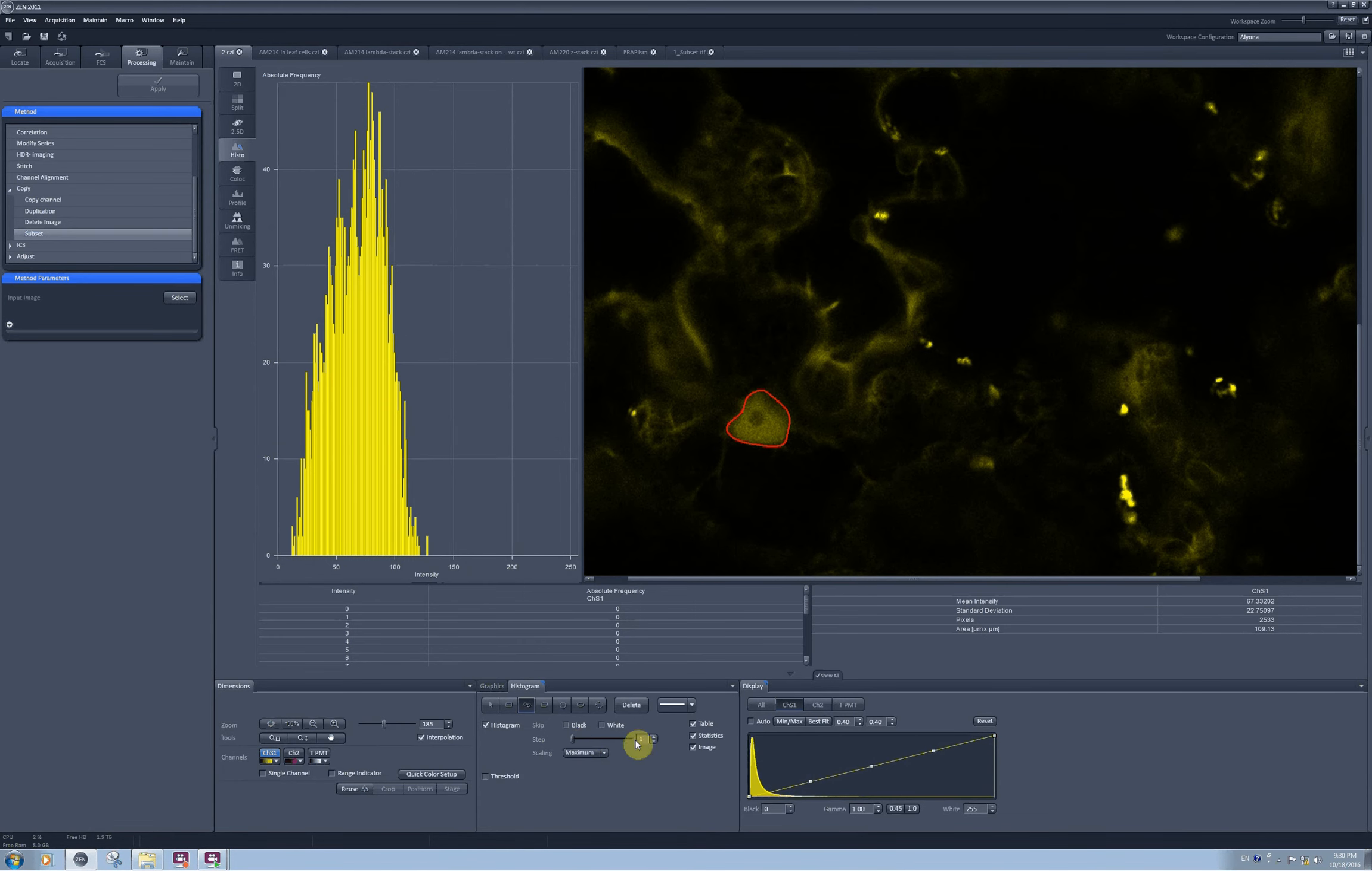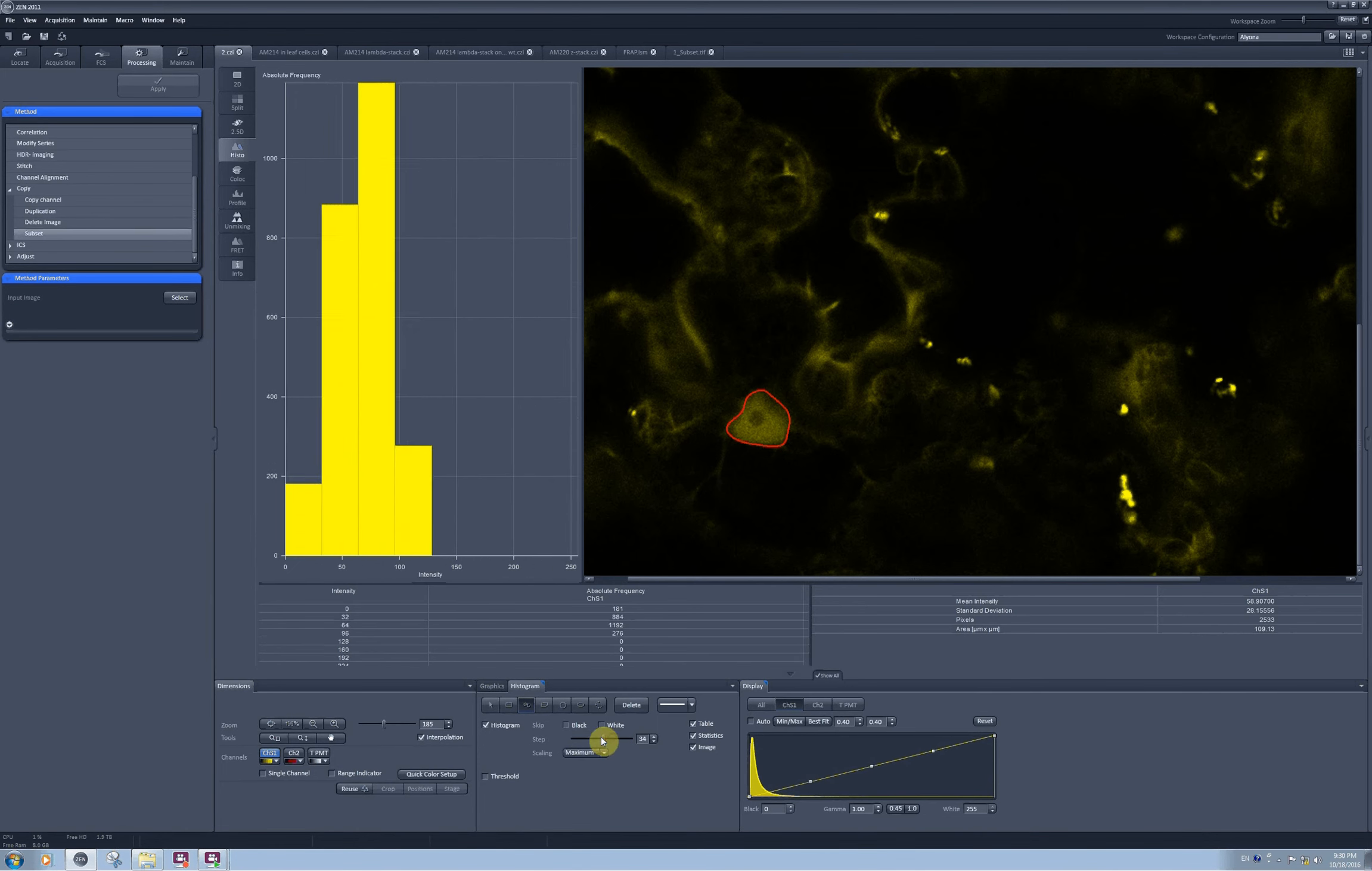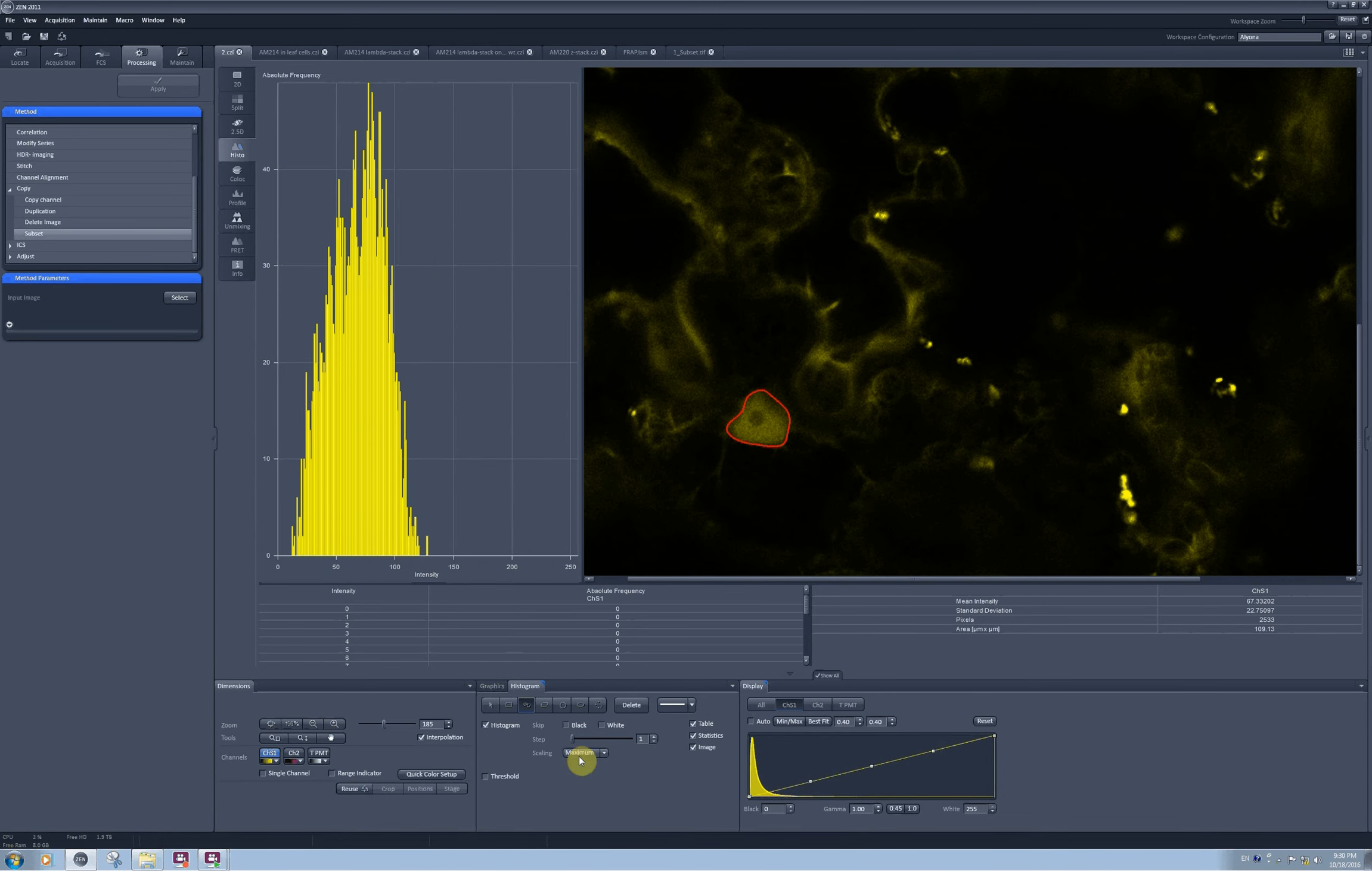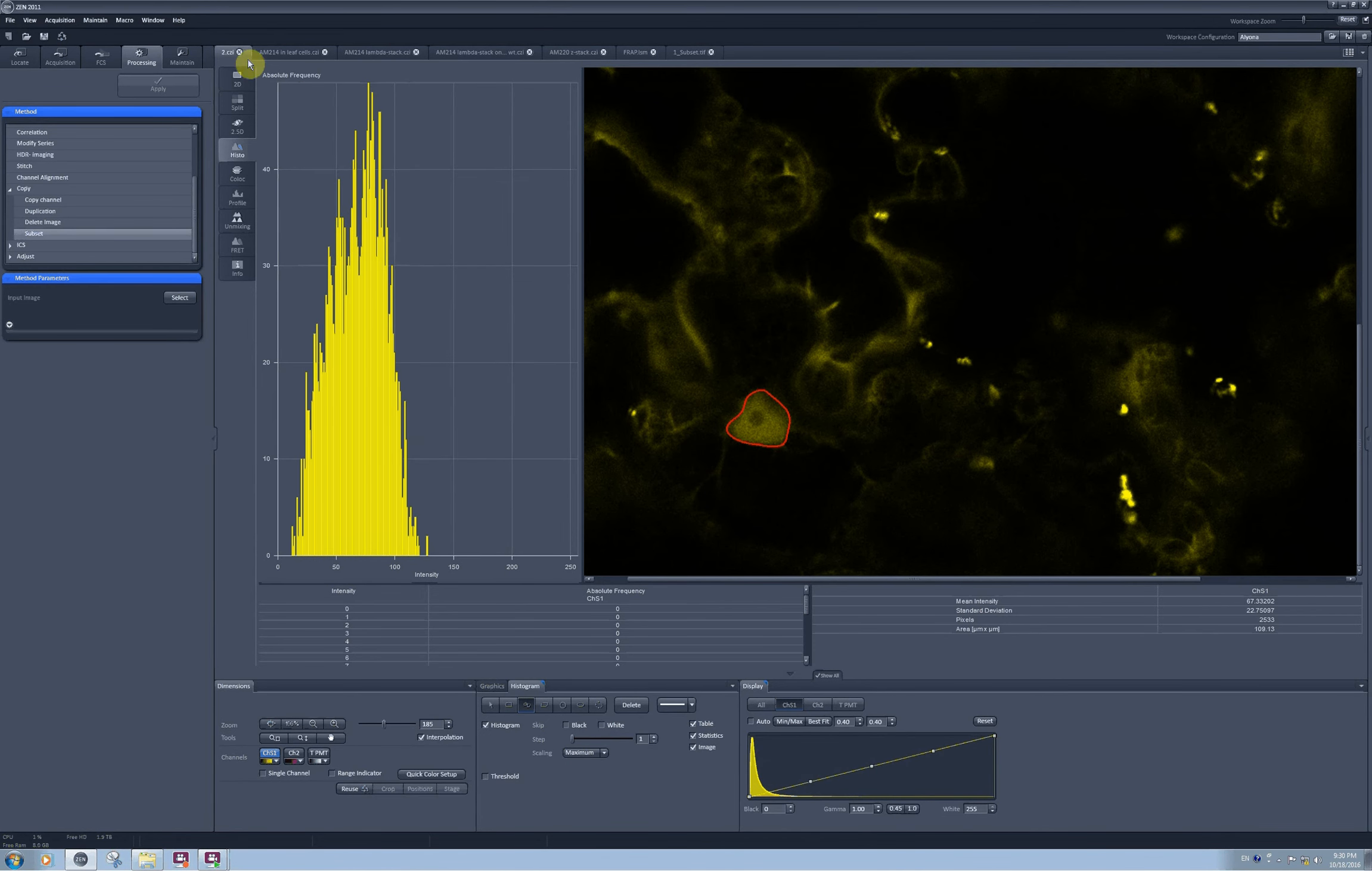This step changes the precision of your histogram and increases averaging, and it will change also the mean intensity here. What the software does is bin together frequencies for pixels of these intensities. You can also ask to rescale the y-axis for absolute frequency. You can set it to fixed value and select whatever you want, or you can ask to fit it to the maximum intensity present on your image.